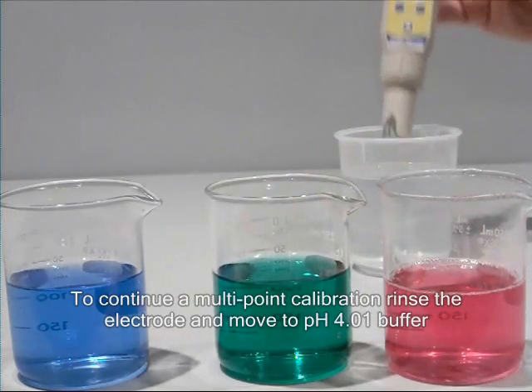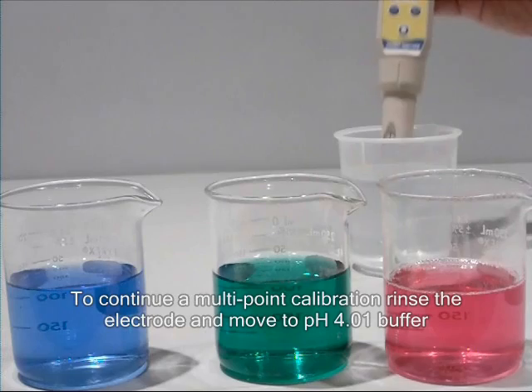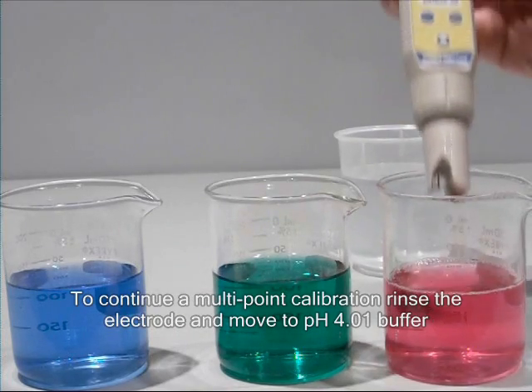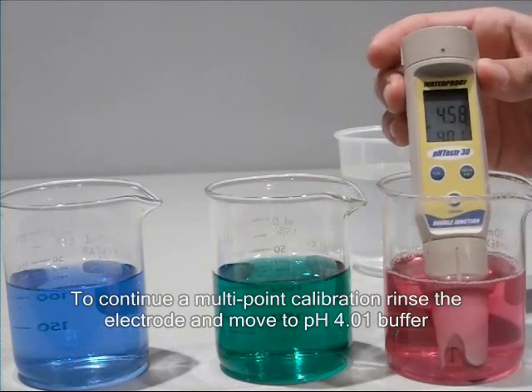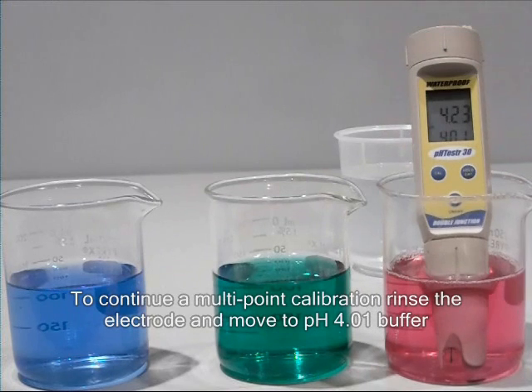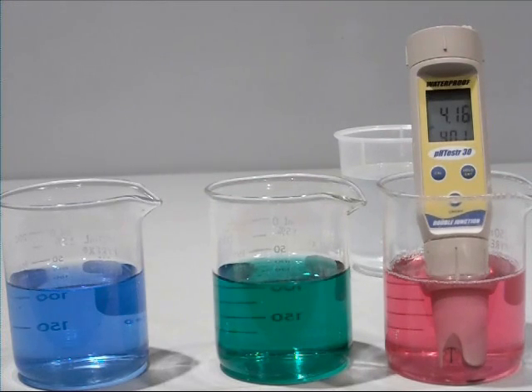Rinse the electrode, then place in pH 4 buffer solution. Wait for the reading to stabilize, then press the HOLD ENTER key to confirm the second calibration point.